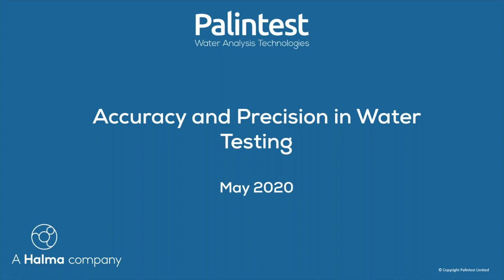This webinar will take you through an explanation of accuracy and precision and their significance when it comes to water testing. I'll explain how to ensure that your data is reliable and reproducible, and how to ensure that you're making the right decision about water management, whether you're using colorimetric or sensor methods to analyse your water chemistry.